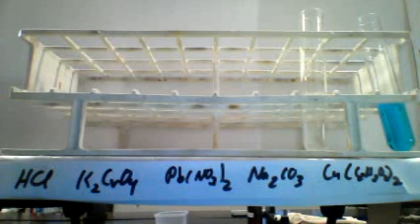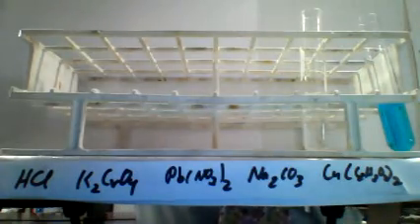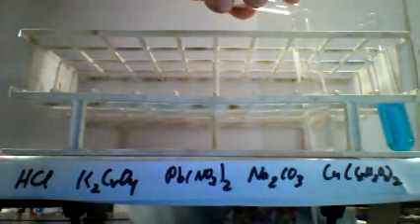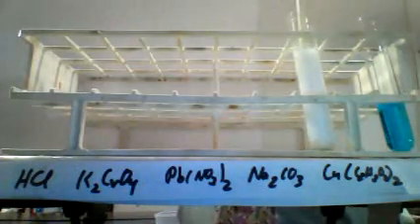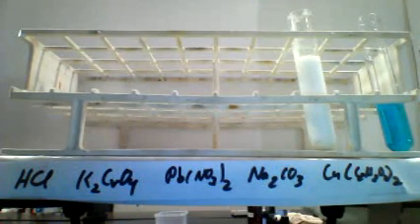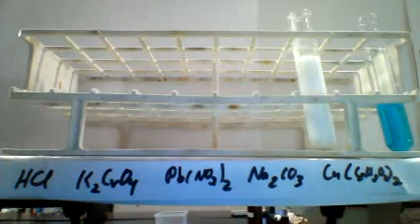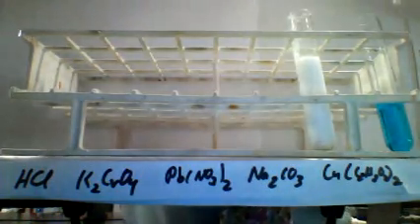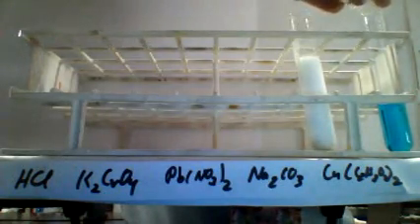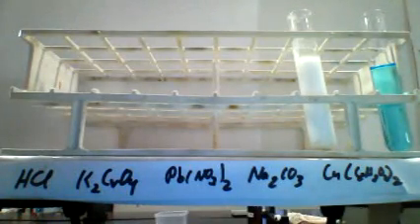Now we're down to our last three solutions. We have to add the lead nitrate to the sodium carbonate and see what happens. Mix them together and observe. Add the lead nitrate to the copper acetate. Mix them together and observe.